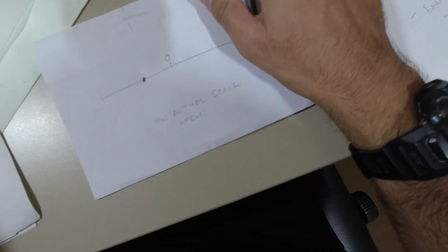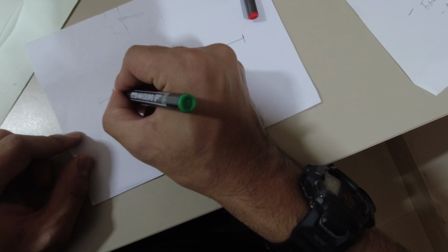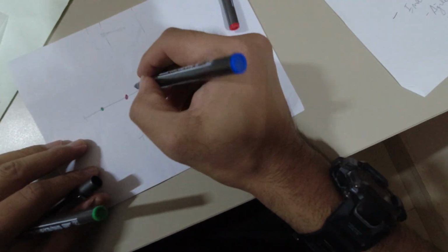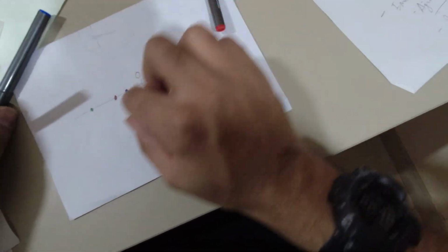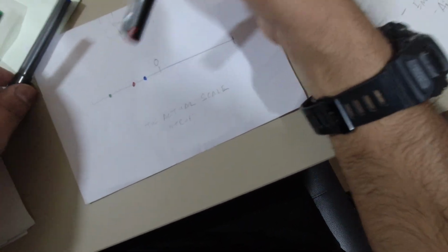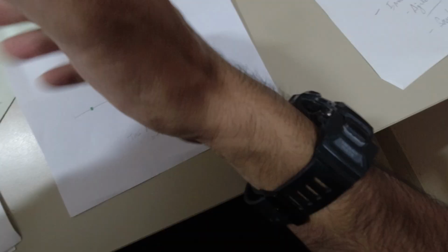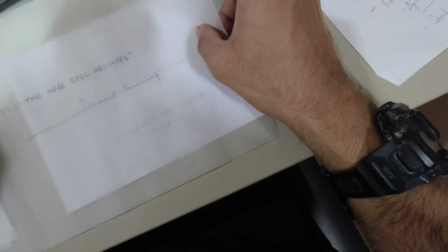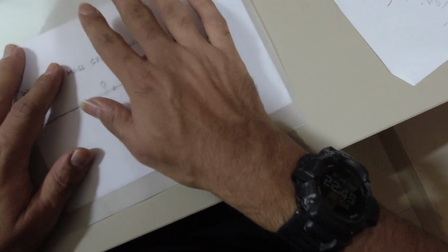Then there's another standard, I'm going to put that in green color. That's over here. And let me just throw in a blue color as well. I'll just put that here. And so this is the actual value of the red, green, and blue standards. And now on top of it, I'm going to put the scale that my mass spectrometer is tuned at.